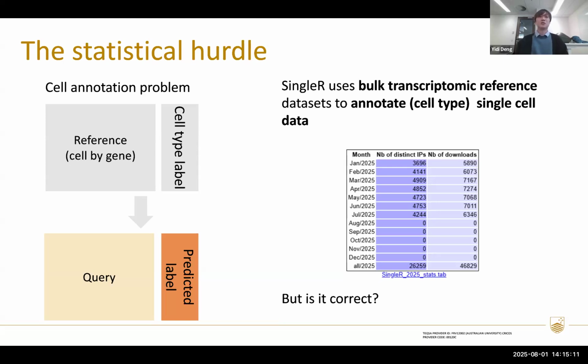Okay. So here, cell type annotation, you can do it not just as a classification problem, but sometimes people just find the differentially expressed genes of each cluster, manually search the literature, and annotate that cluster. But that's actually the second procedure. The manual annotation is more used in today's research.